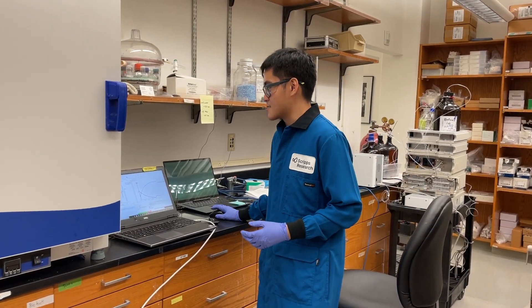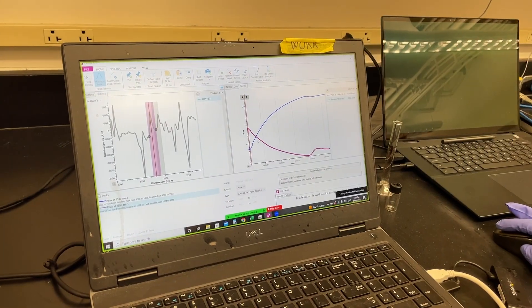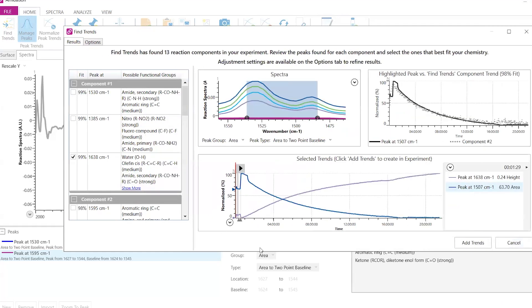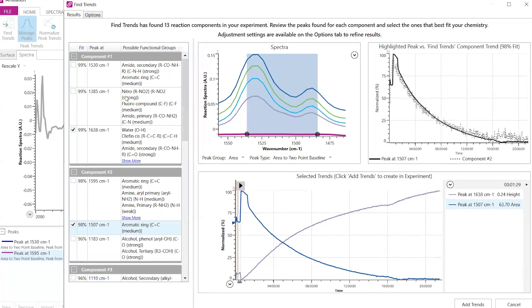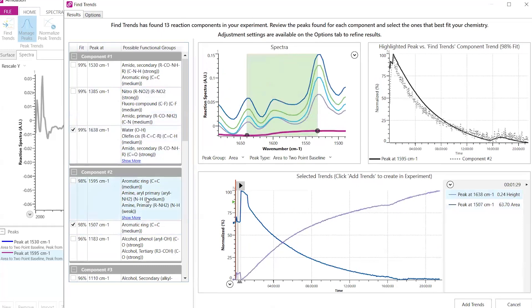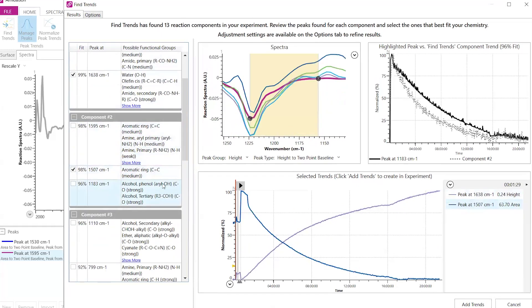So we can take a look at the results here, and you can see that I chose two IR peaks that I thought were good representatives of what's being formed in the reaction and what's decreasing over time. But if you have trouble doing this, say you have a very complex spectrum, you can actually use the feature developed by Mettler Toledo, this Find Trends feature, wherein it will automatically do this for you. And so you can see here that some traces are grouped according to how much they have increased over time. And you can see here different peaks that correspond to this component of what the software thinks is the same molecule. And you can see here something that has decreased over time. And so this helps if you have a really complex spectrum.